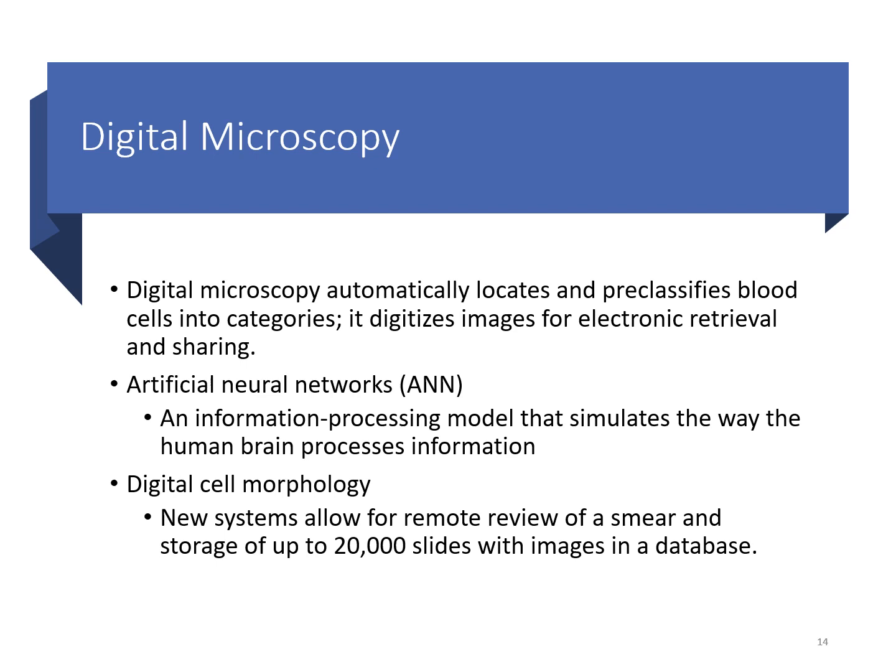With digital microscopy, it does allow the storage of those actual images. Whereas now we keep the microscope slides once they're made, and we save those for a couple of years before they're discarded, this digitally stores those images so that they can be reviewed at a later time. And now, with things being more electronic, that database can be preserved for quite some time.